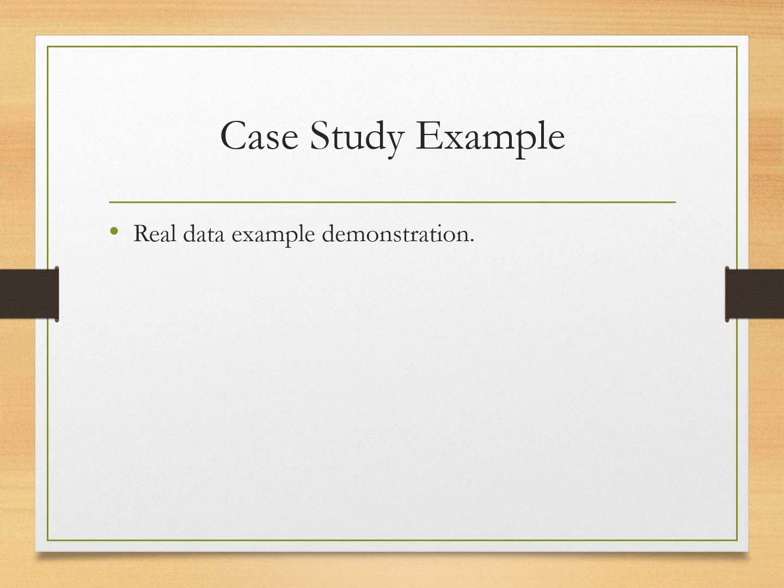We can take the example that if we want to check the phytochemical profile of a medicinal plant, then we can prepare the sample by the method and then analyze the sample in the instrument.